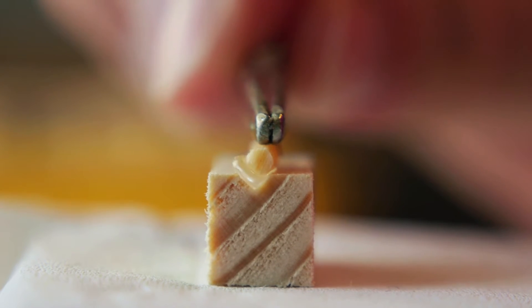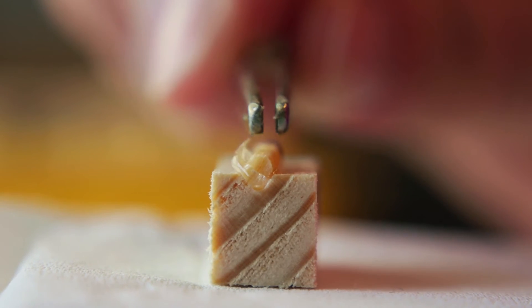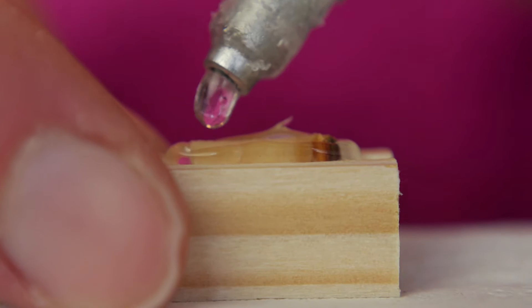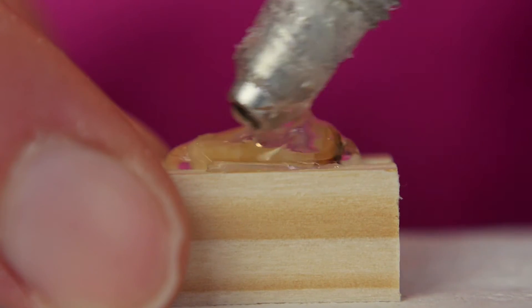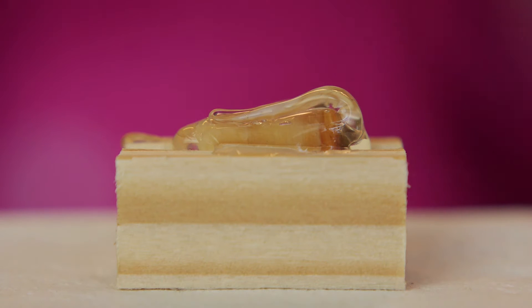Push the sample with the forceps into the notch of the holder. Take care that you mount the sample with the fibers perpendicular to the holder in order to attain good thin sections. Then cover the sample completely with glue. This will prevent the sample from drying out quickly and forming cracks. Let the glue harden for 24 hours.